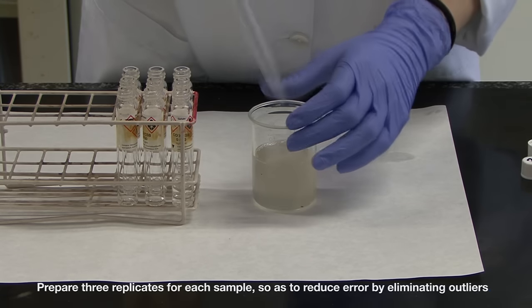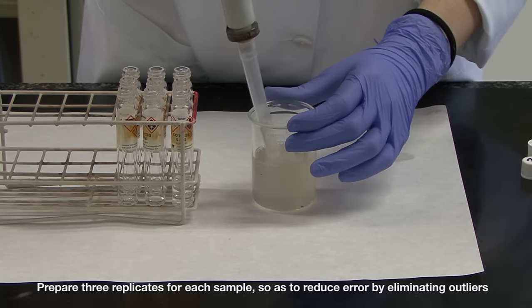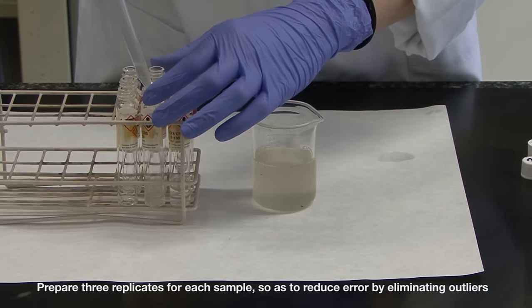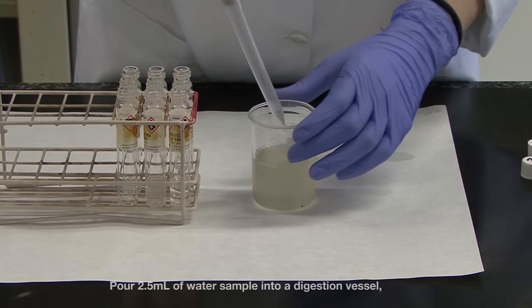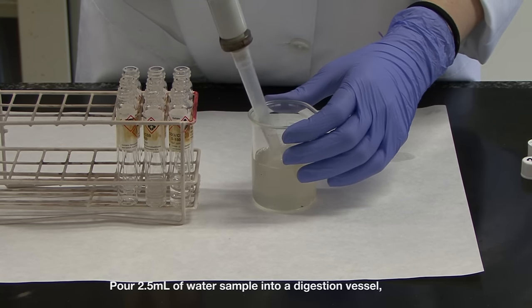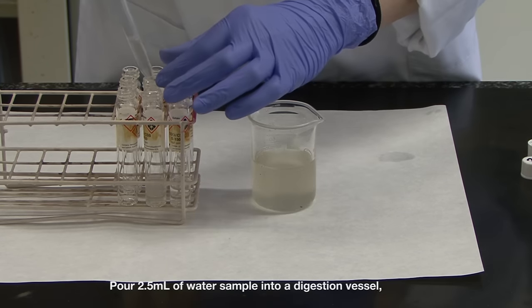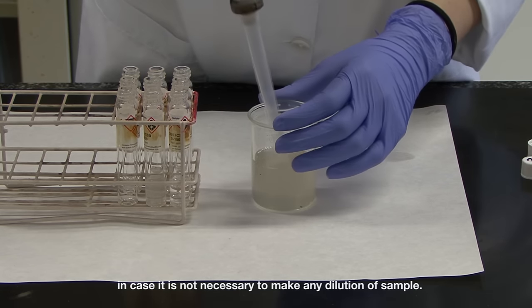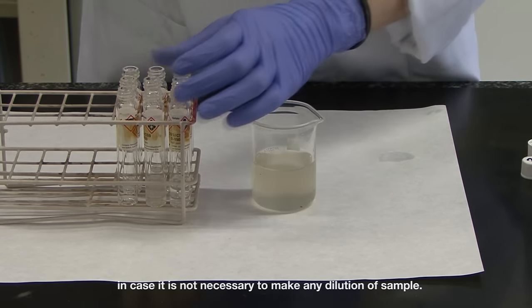Prepare 3 replicates for each sample, so as to reduce error by eliminating outliers. Pour 2.5 ml of water samples into a digestion vessel, in case it is not necessary to make any dilutions of sample.